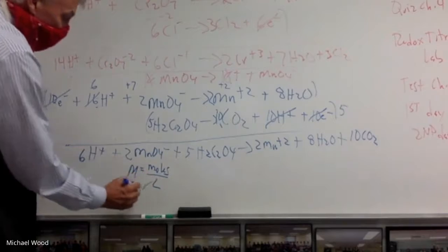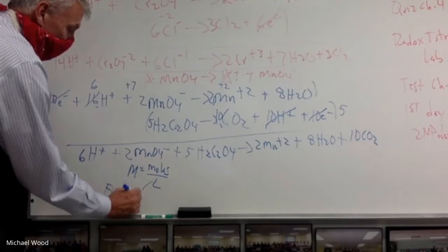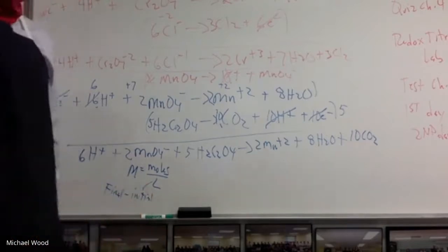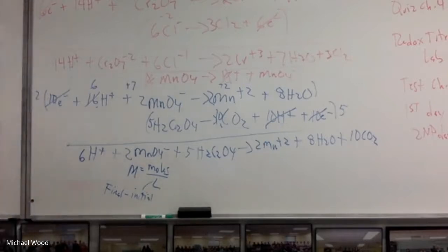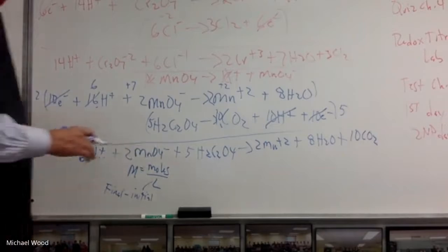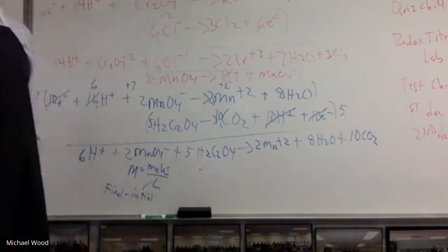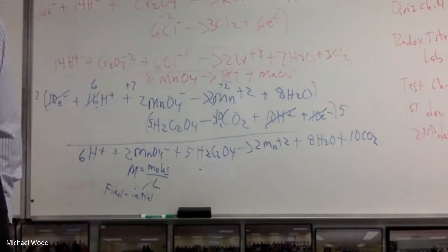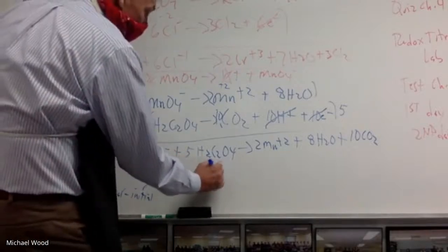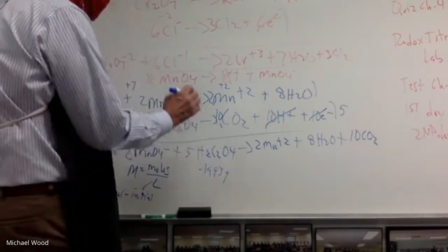Well, the liters we know. We'll just take the final minus the initial. What do we have, like 34 something point something, and 2 point something? Let's subtract those. But we've got to get into liters. But the moles is we're going to take this. Kylie, what was the mass of the oxalic acid? 0.19 something? 0.1993, like that.